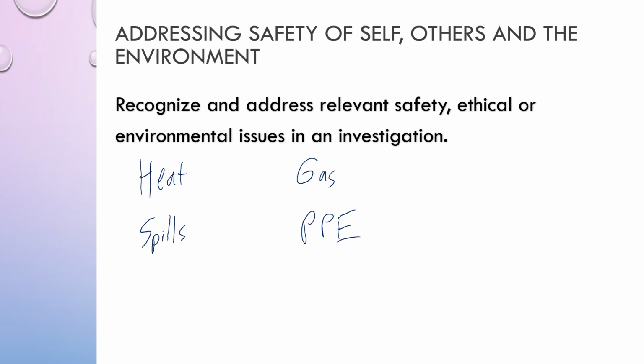In any situation, you want to consider how you're going to dispose of any materials that are left over at the end of your experiment. So that's where we're getting into environmental issues. So what's going to happen if you were to flush that stuff down the drain? Or are you even allowed to do that? Do you need to be disposing of it in a completely different way? So again, I just want this to be a very general, hey, you need to pay attention to these things and make sure that you look them up, especially when you're designing your internal assessment.